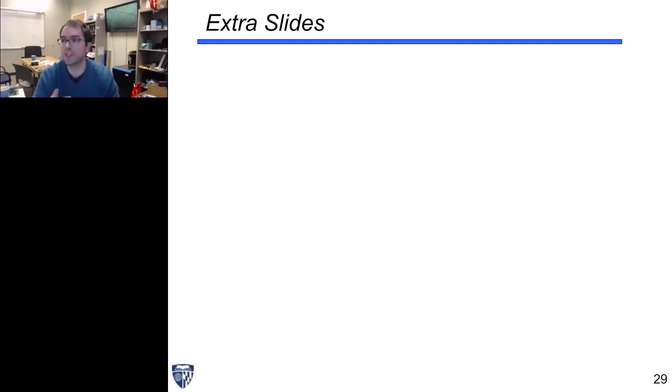So we have to do some PCR, some polymerase chain reactions and amplification. What that means is that you've eliminated the methylation marks, and so we can't do a native methylation. We need to put in raw DNA right from the cells to be able to look at the methylation marks. If you do PCR, the methylation gets erased. So because of limitations in our capture methodology right now, it's not possible.